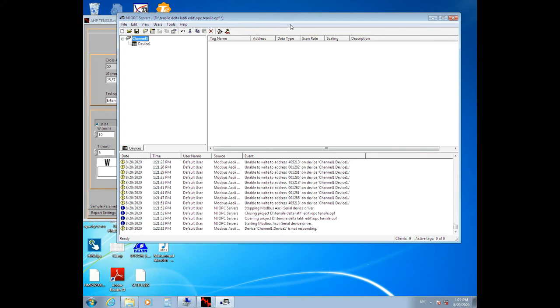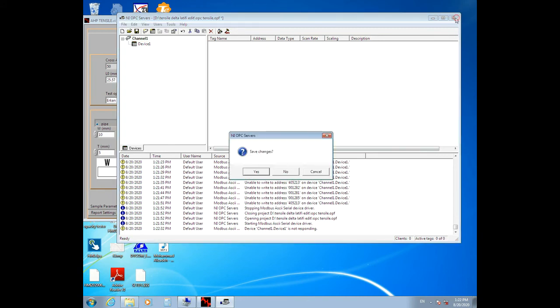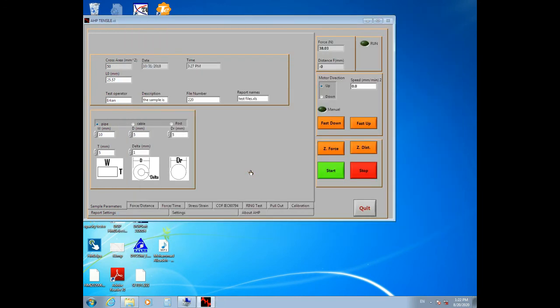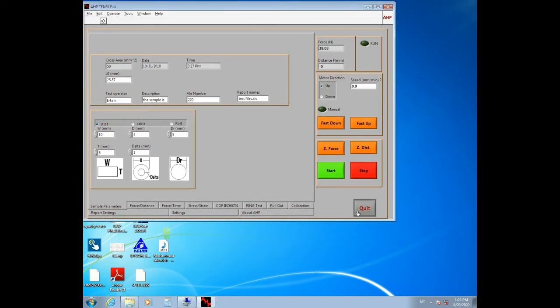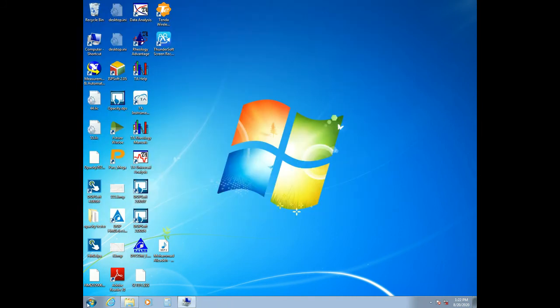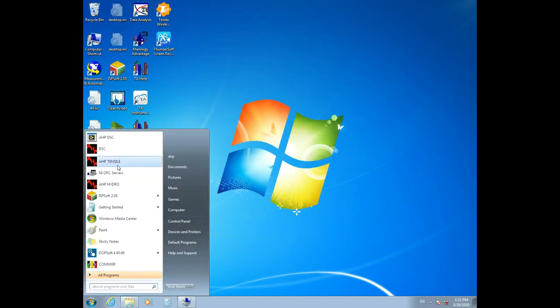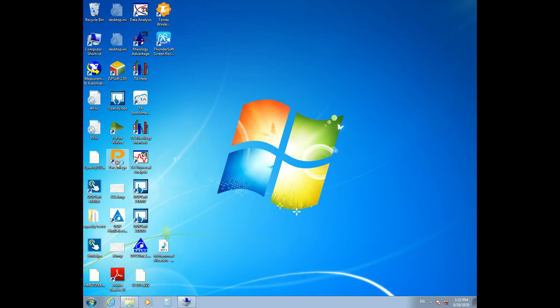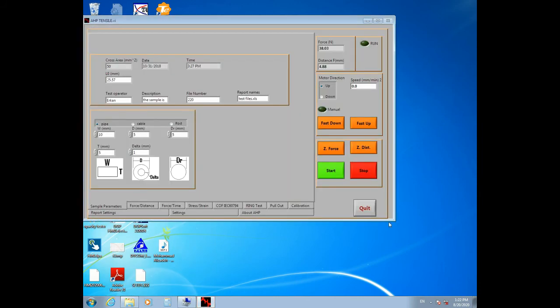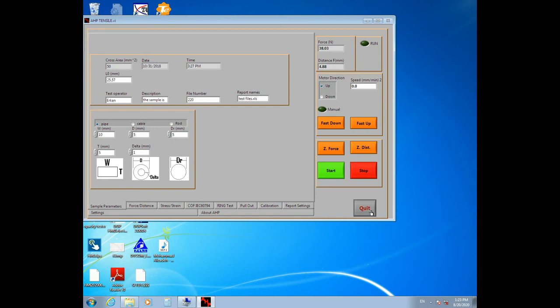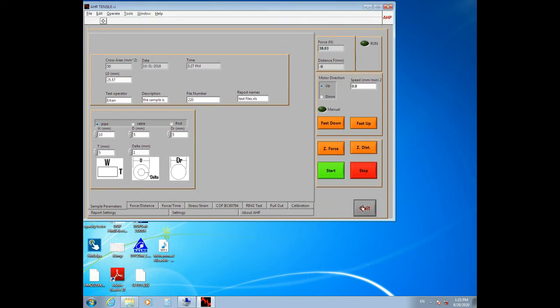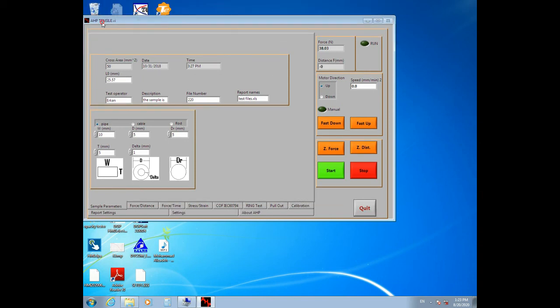Then open the AHP Tensile software again, click on Quit, and then run it again.